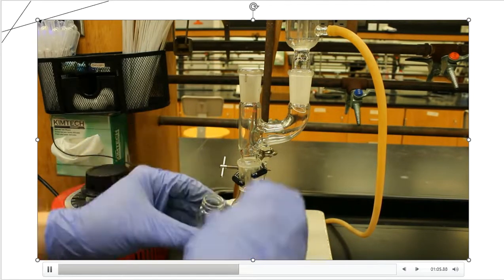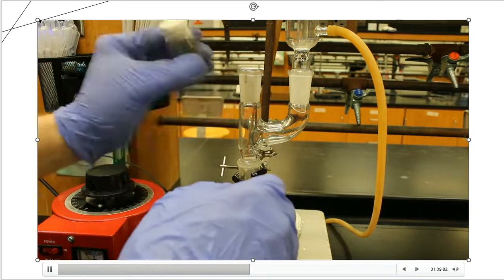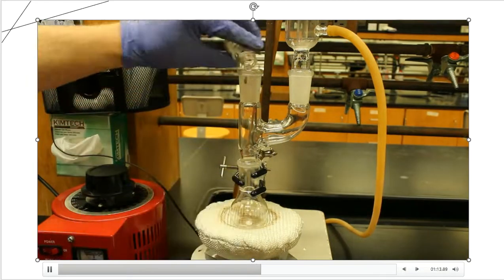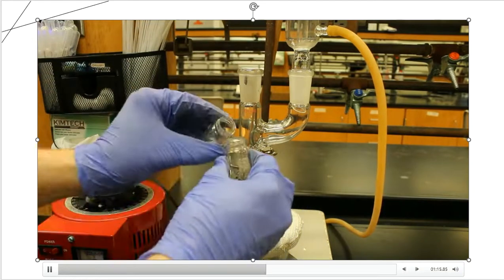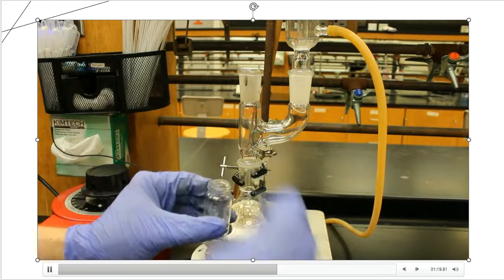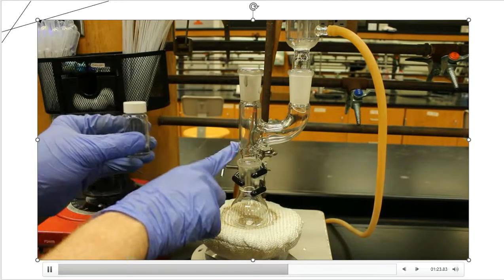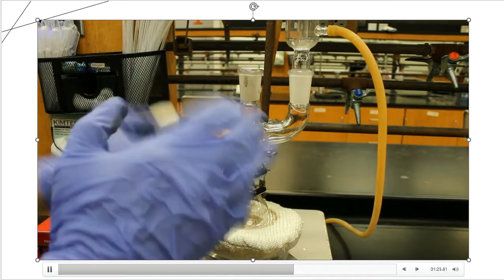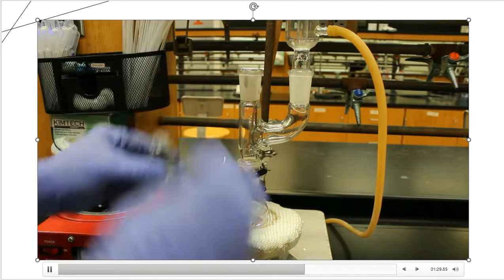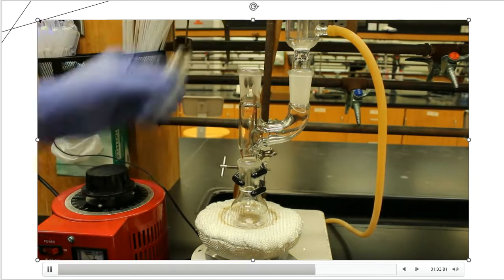I'm going to have to add the methylene chloride anyway. So I want to make sure that that container gets completely flushed out with the anisole. So I'm going to do that in a second portion. And then finally, I'm going to do it in a third portion, and that methylene chloride is also going to cling to the sides of this piece of glass, and it's going to get rid of all of the anisole that might be lingering there as well. So the more times that I give it a flushing of methylene chloride, the better off we're going to be.